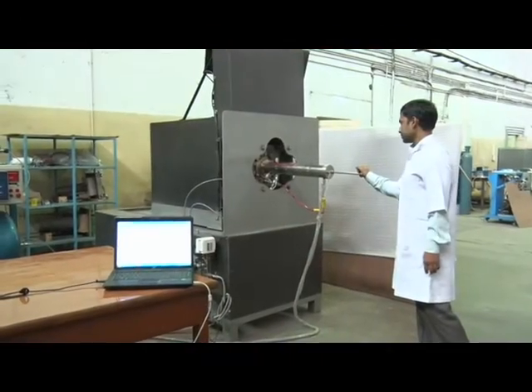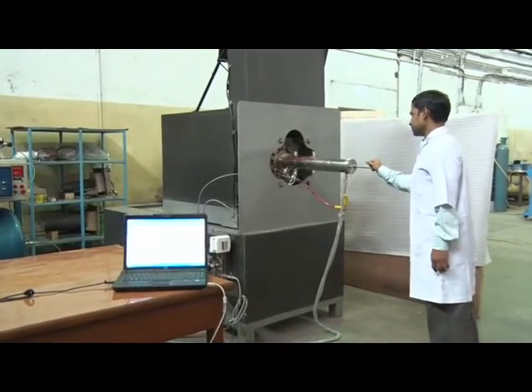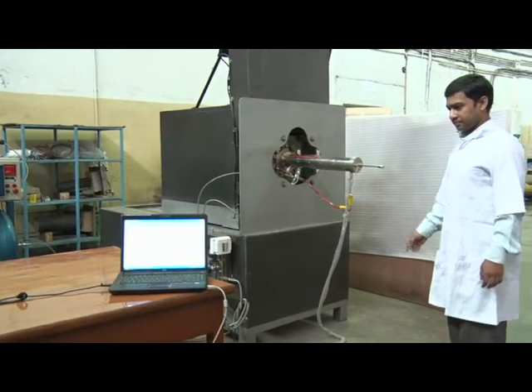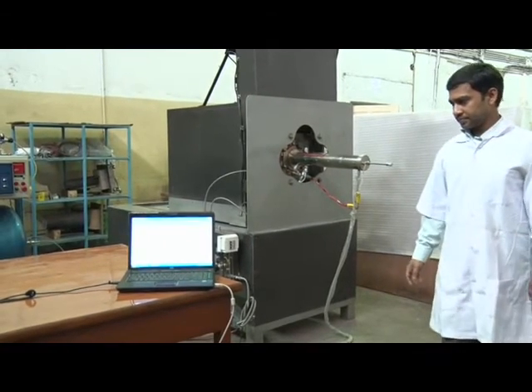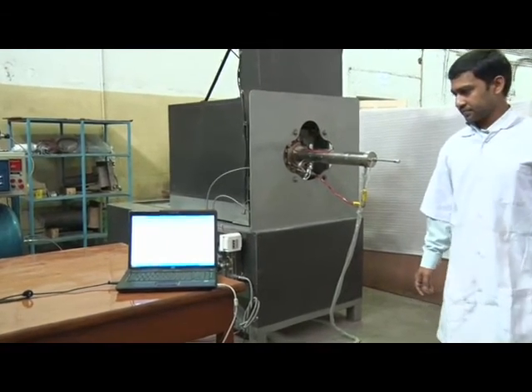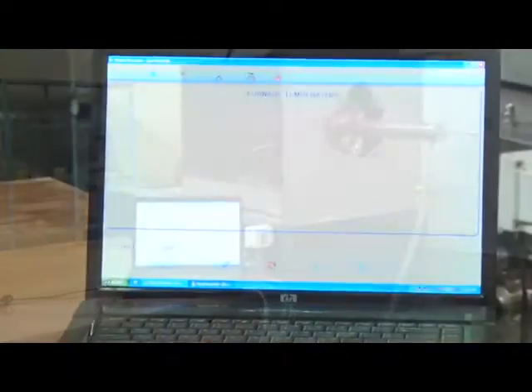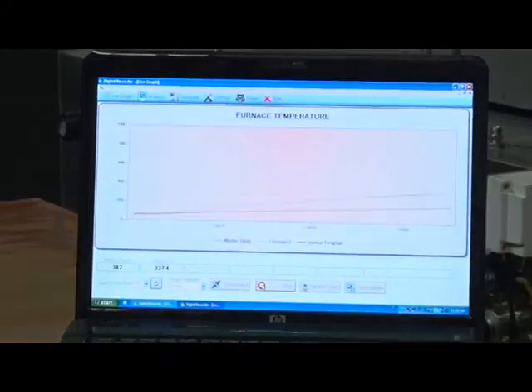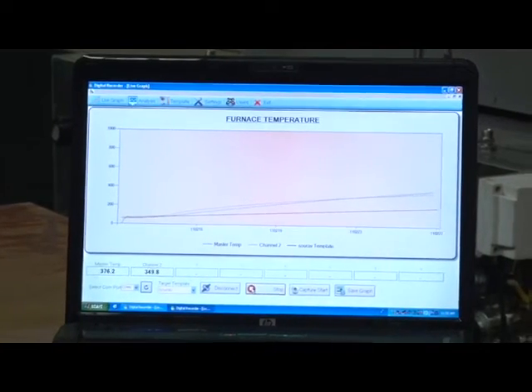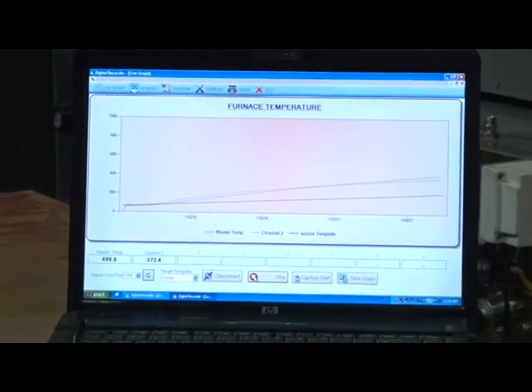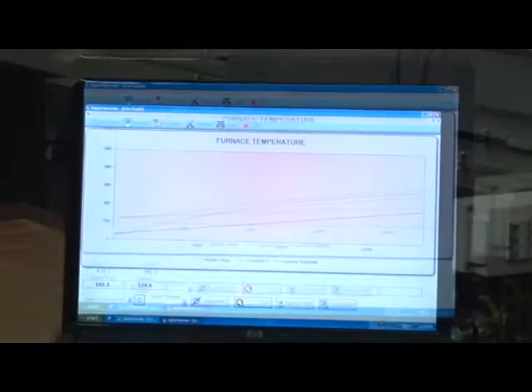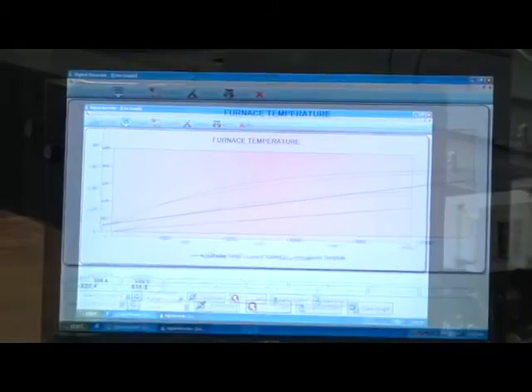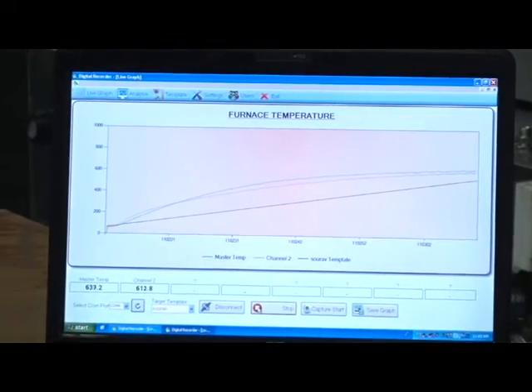Continuous annealing is initiated by making the specimen travel into the hot chamber by simply pushing the specimen mounting frame. The real-time data acquisition system allows you to record the temperature profile of the specimen as well as its surrounding gas atmosphere by two thermocouples provided with the specimen mounting frame.